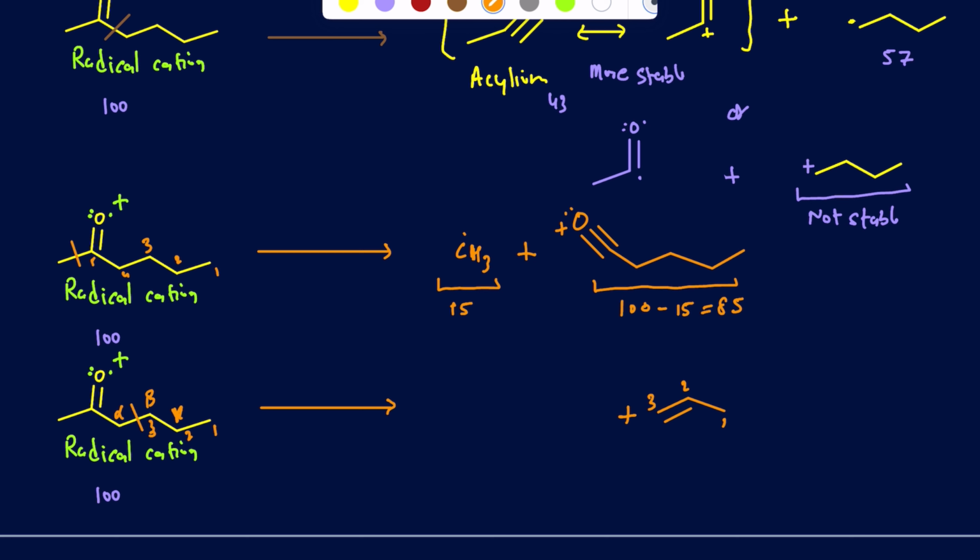And that makes a full molecule, and that leaves you with basically a radical cation again. So the radical cation that's going to be left behind here is more or less going to look like this. So that's what we got in there.